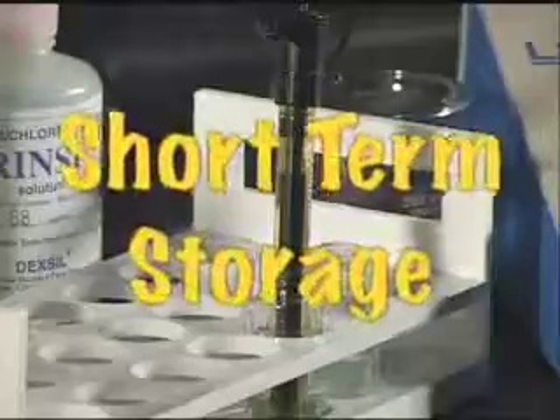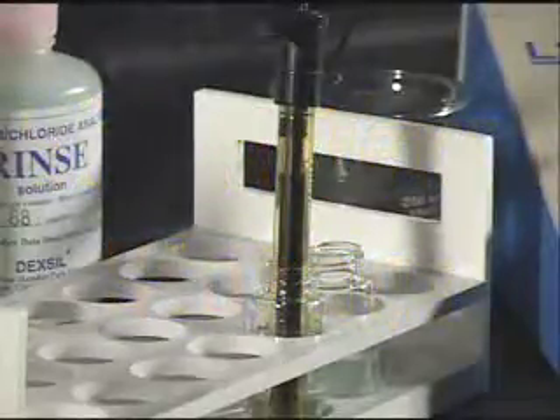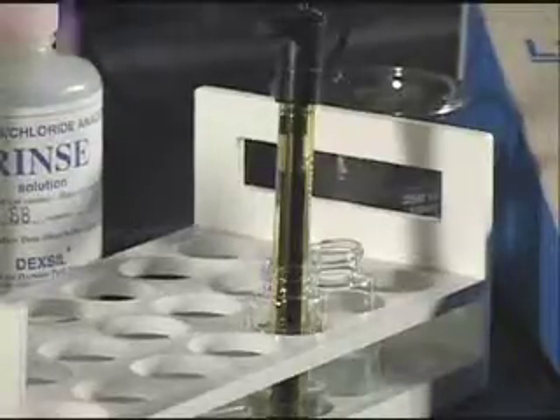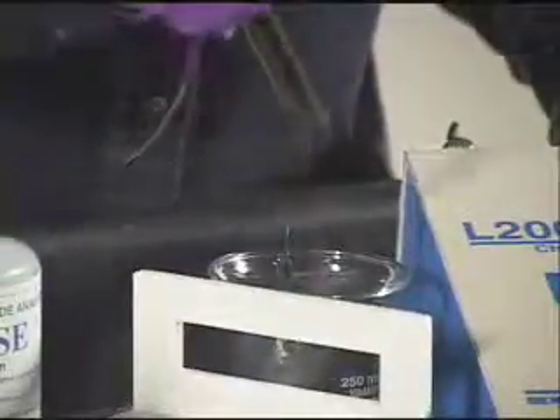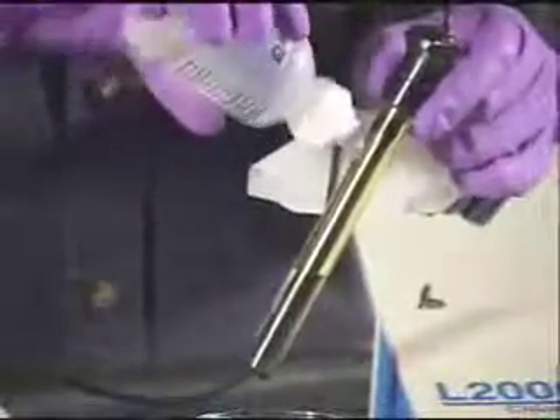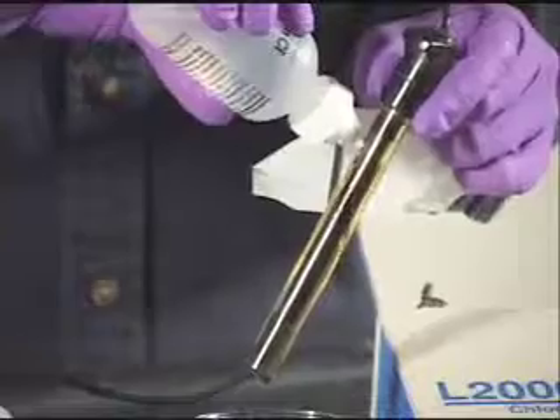Short-term storage: When the electrode is used on a daily basis, the electrode can be topped off with electrode filling solution and stored in the rinse solution overnight. The next day, drain a small amount of filling solution from the electrode, add additional electrode filling solution, and store in fresh rinse solution.